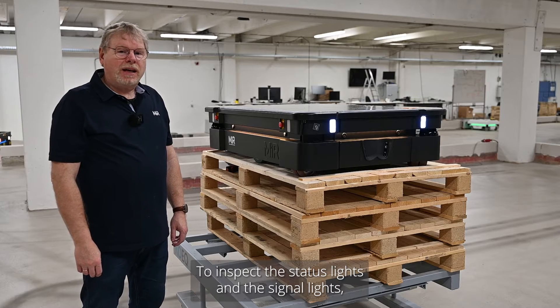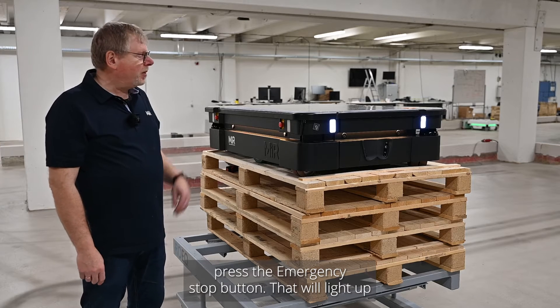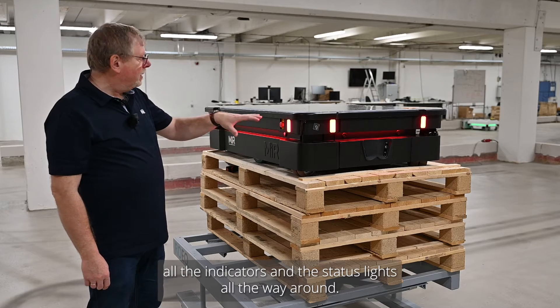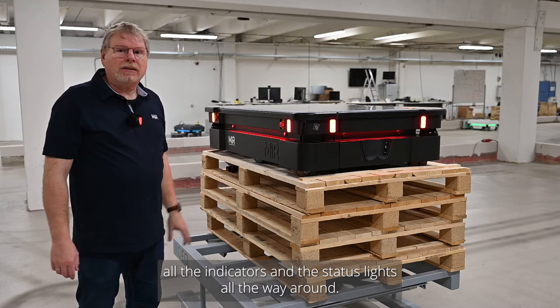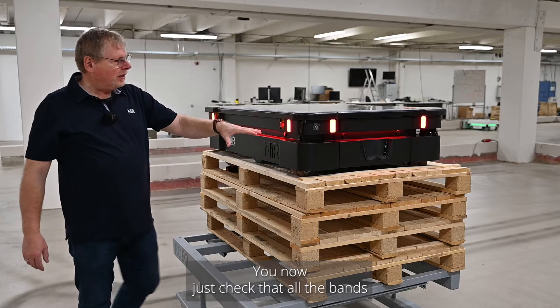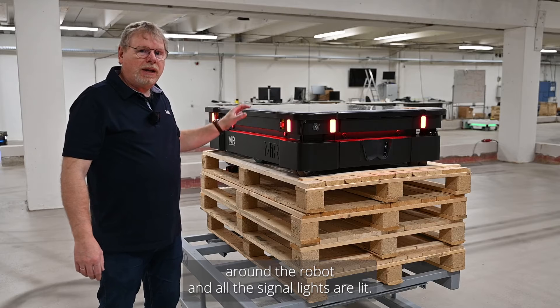To inspect the status lights and the signal lights, it's a good idea to press the emergency stop button — that will light up all the indicators and the status lights all the way around. You then just check that all the bands around the robot and all the signal lights are lit.